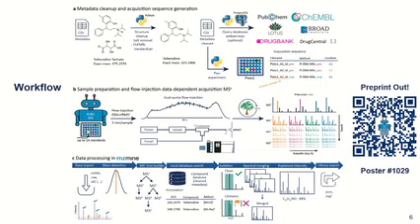But generally, the metadata cleanup is important if you get from a vendor the compound sheet, but sometimes they provide the compound structure as a salt. So here in this case, we have this tartrate, so we need to get rid of this salt. We have this as a Python script. And then sometimes you might have only a compound name and not structure information. So we also enable in the script that you query PubChem and you get additional structural information. And from here we can then also generate the exact mass for this compound, the chemical formula, and everything that can be computed if we have the structure in the end.